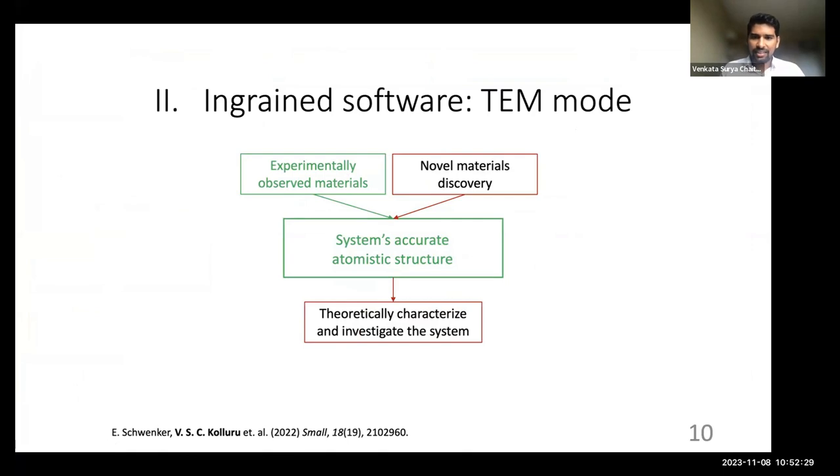Joshua has explained the first part, which is the STM mode of the Ingrained software. So now I will walk you through the TEM mode of the Ingrained software and also show an example where we use the Ingrained TEM mode to characterize the grain boundary of a material and find its structure and unravel interesting phenomena.